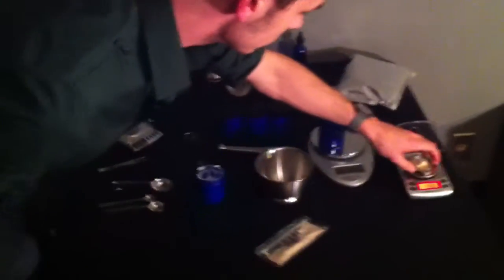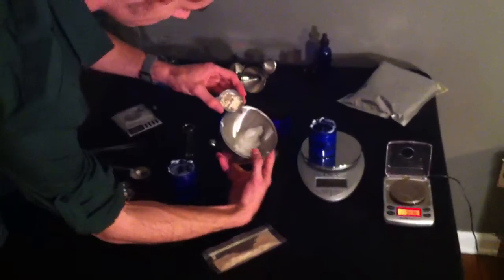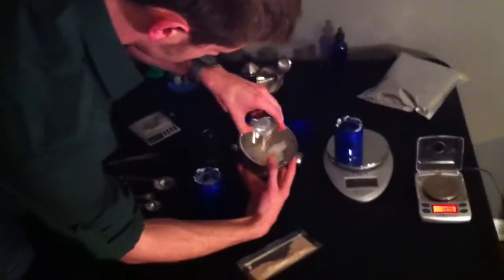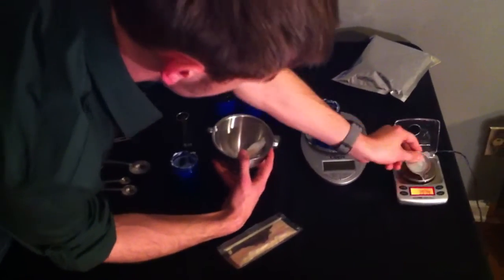Now, here we go. I'm going to go ahead and, for the first time, mix this together. Let's see if I can put this here. Add the weighed-out two grams in. There it goes.